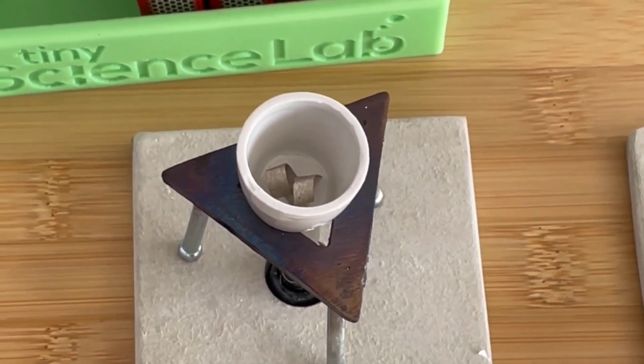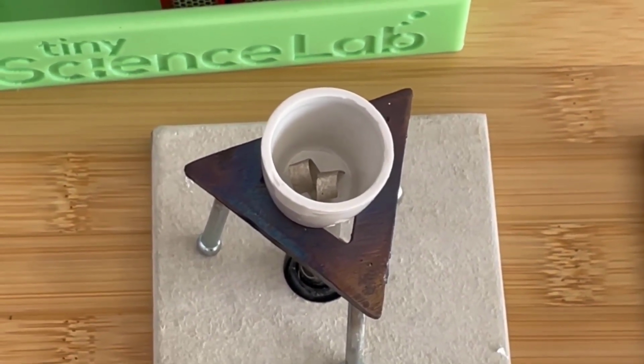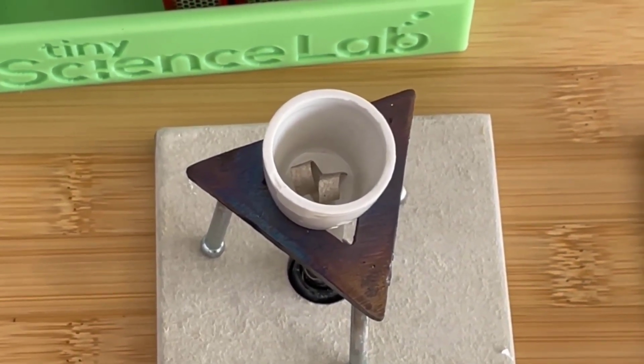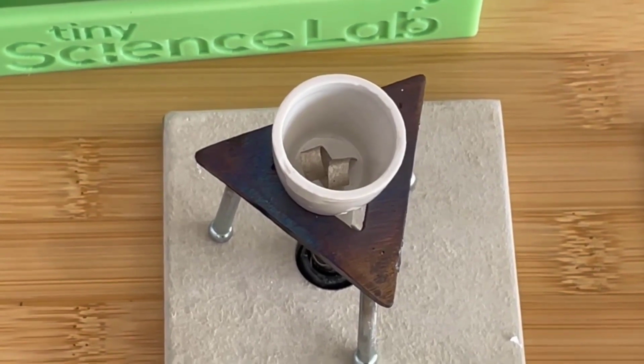So obviously with the ceramic crucible, it takes a little longer to heat up, and it takes a little longer for that heat to transfer into the magnesium, and therefore for the magnesium to rise to a sufficient temperature where it's going to react with the oxygen in the same way that we saw when we put it directly in the flame.